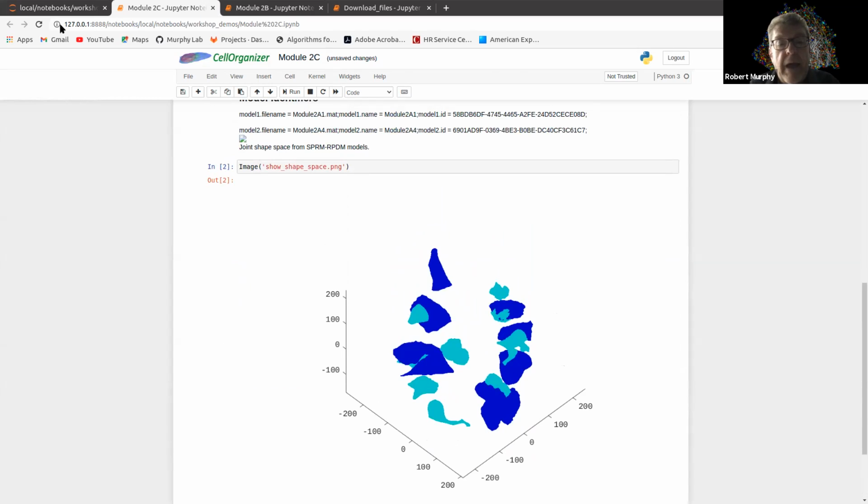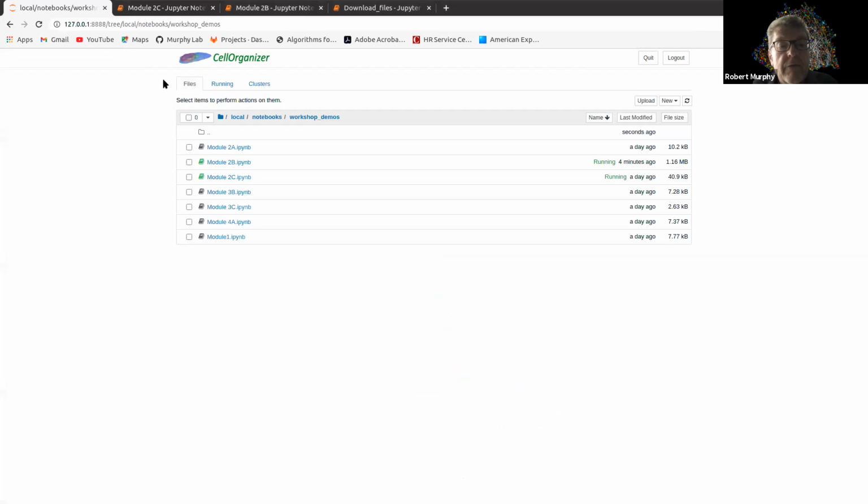And that allows you to compare them, in this case, visually. Now, what you can also do, it's going to be in the next sub-release, is build a model of the probability distribution density of the cells and compare those. I talked about that today. That's not in this release. That'll be in 2.9.3. All right, so that's comparing 2 models via SLML to report.